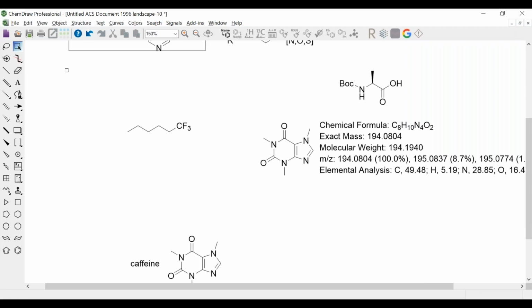Excellent. One thing to note about ChemDraw Plus is that it is within the Signals Research platform, and it is getting updated on a monthly basis. We push updates to that application every month. It's on a faster release cycle than the desktop product itself. As you continue to use it and check back in the application, you'll see new features and functions added there as well. We'll have a lot of cool things coming in the next few months, and I'm sure in the next ChemDraw Connect series, we'll give some previews of what's to come.